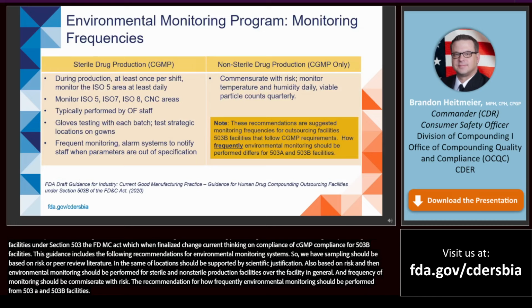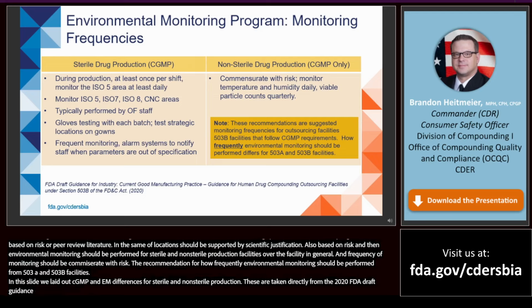In this slide, we have laid out some cGMP EM differences for sterile and non-sterile production. These recommendations are taken directly from the 2020 FDA draft guidance for industry titled Current Good Manufacturing Practice Guidance for Human Drug Compounding Outsourcing Facilities under Section 503B of the FD&CA.